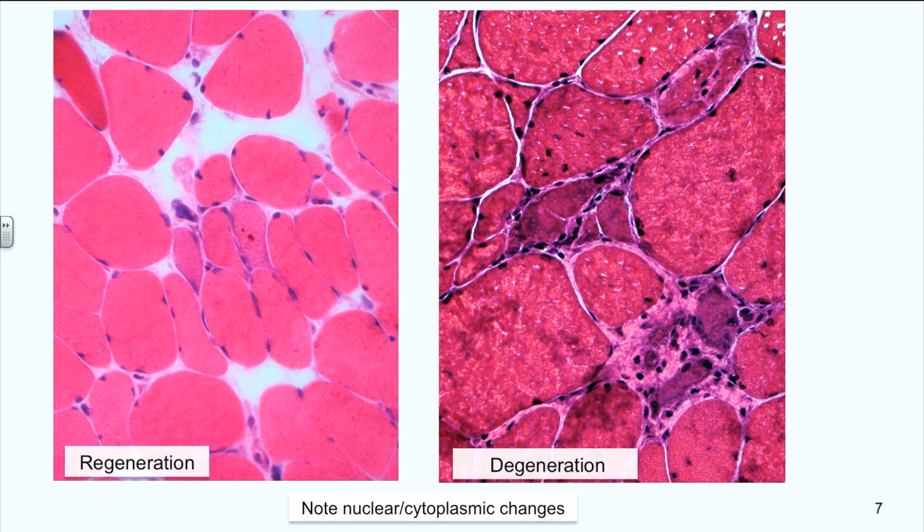We talked about alkaline phosphatase and acid phosphatase in lecture number 2 about the turnover in the muscle as part of hydrolytic enzymes. How can we say that there is regeneration and degeneration in a muscle? Morphologically, it is possible. Sometimes it's difficult because the muscle may be so damaged that the only way to look at it really is through those enzyme reactions. But again, those enzyme reactions kind of confirm what we see on standard morphology. And here we have examples of them.